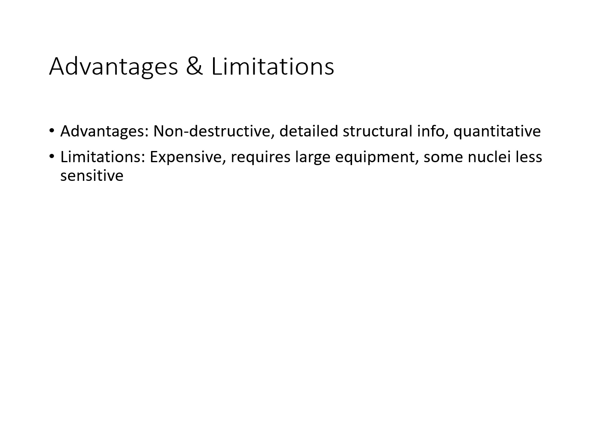NMR offers several advantages as it is non-destructive, highly informative, and can provide quantitative data. However, it is expensive, requires highly specialized equipment, and some nuclei are naturally less sensitive.